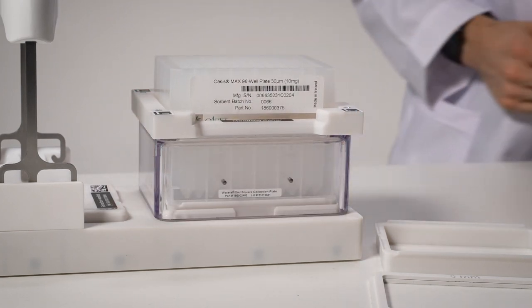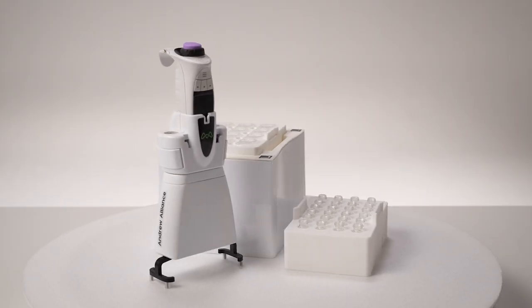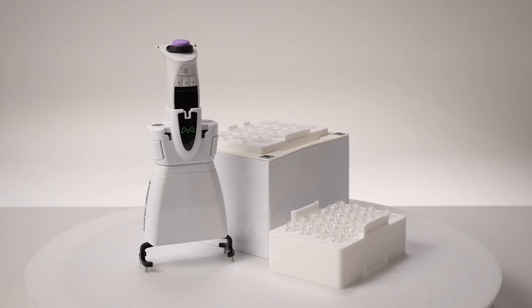Next, the ability to automate the replacement of collection labware requires two key components: an extra domino position on your bench and the Andrew Plus microplate gripper tool.